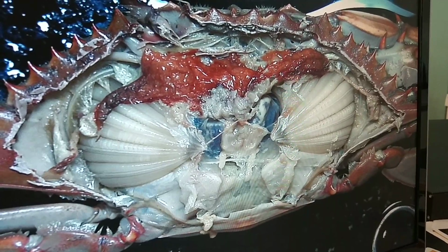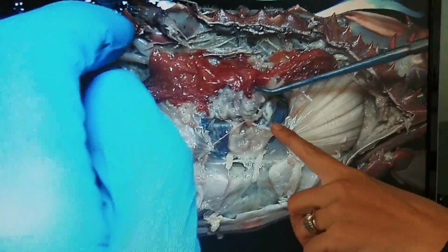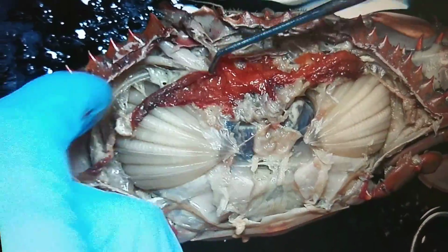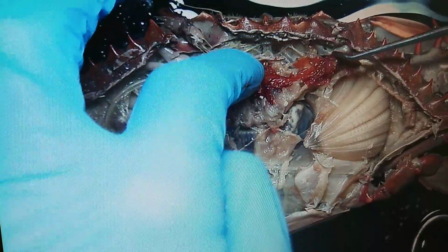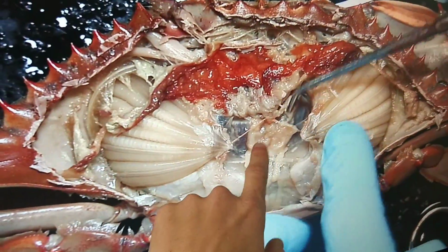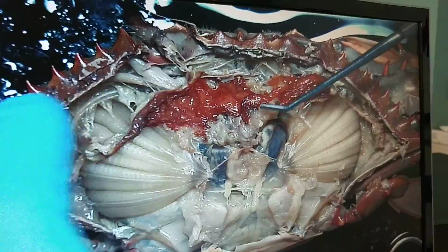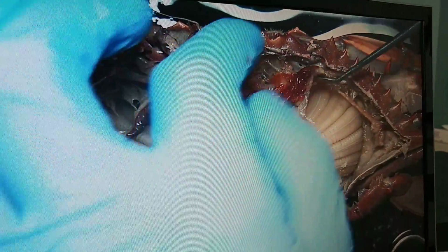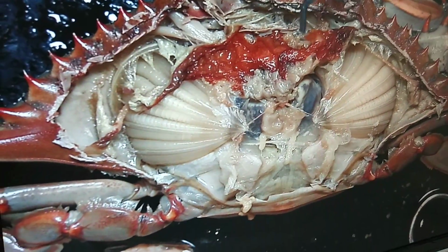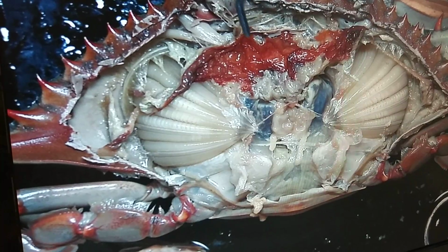Can we see the pyloric and the cardiac stomach or no? I feel like this is probably the cardiac stomach, all this mess. Well, there's a couple things going on here. The ostia are going to be on the heart. You really can't see it all that well, unfortunately, because it's kind of a gooey heart. But it looks like our gal's reproductive system and stomach kind of exploded, because that happens.